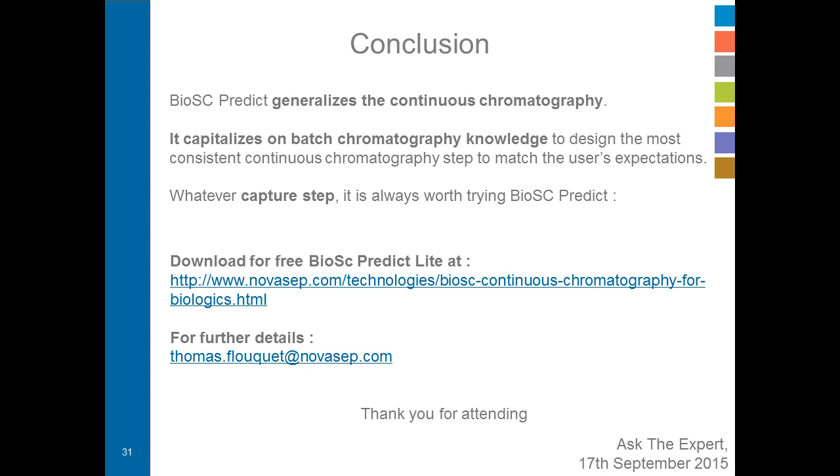No, because the parameters that are coming from the simulation, the end-column and push value, are valid only for the Biosc unit.